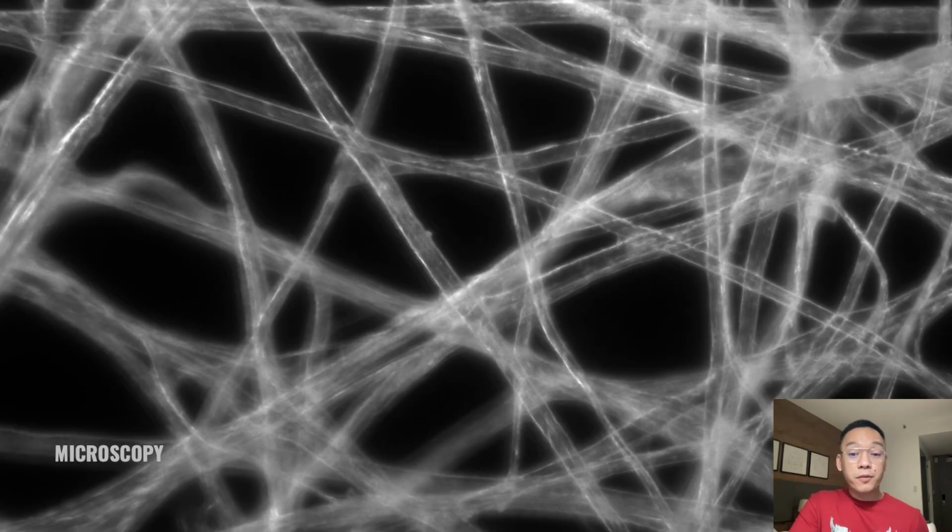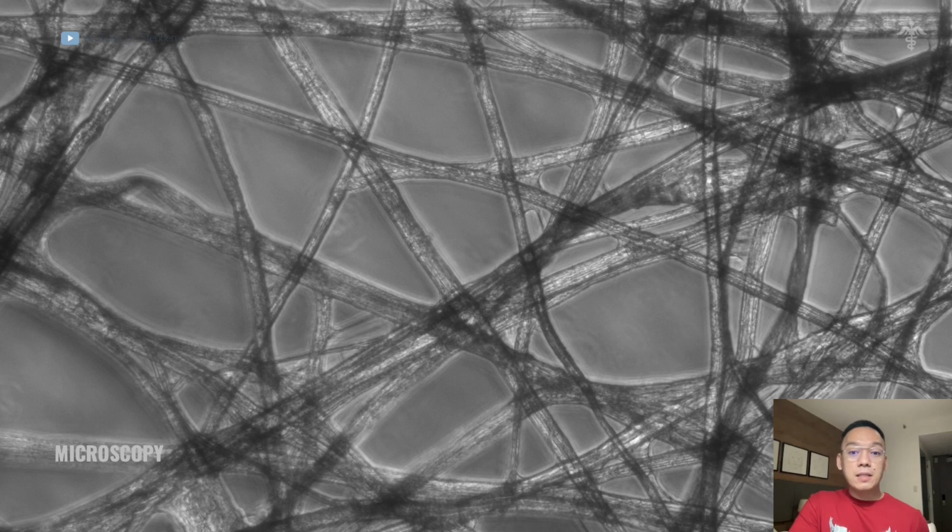This is a dark field illumination. Sample contrast comes from light scattered by the sample. This is phase contrast illumination. Sample contrast comes from the interference of different path lengths of light through the sample. Here you can see the minute details within the structures.